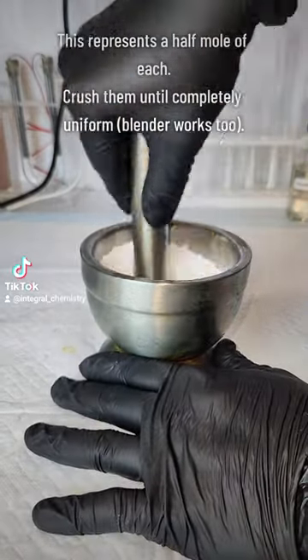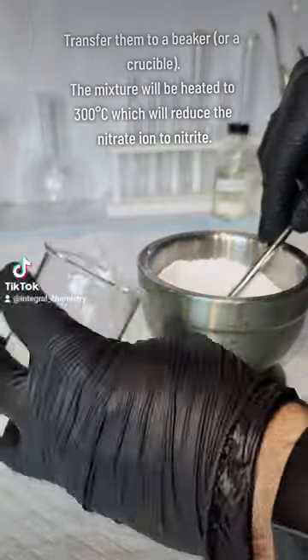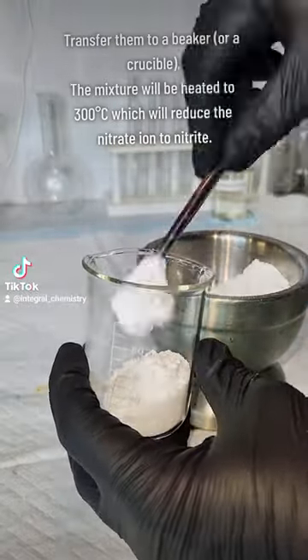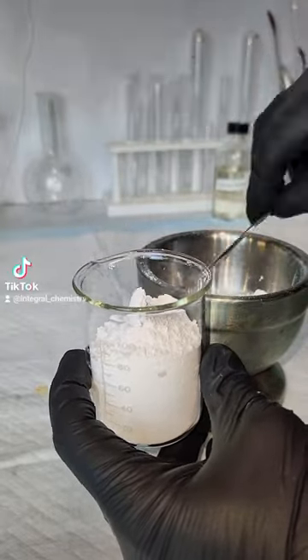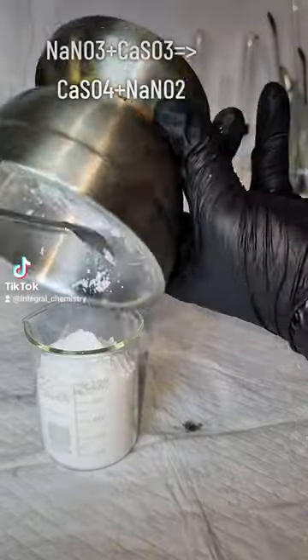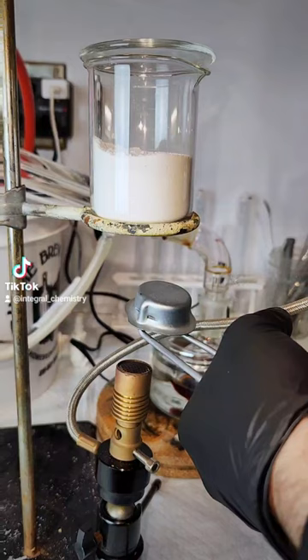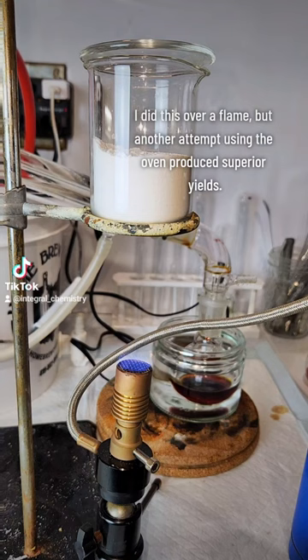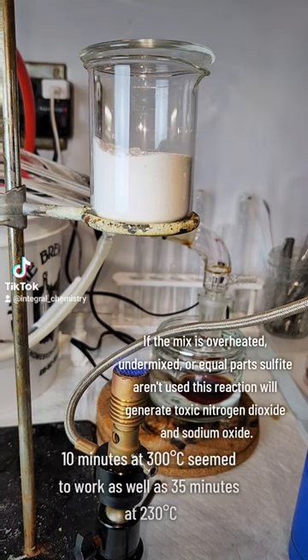To get started, I begin by crushing together stoichiometric amounts of sodium nitrate and calcium sulfite. This mixture is going to be heated, which is going to reduce the nitrate to nitrite and oxidize the sulfite to sulfate. This process is conducted entirely in the solid state, so it's really important that your reagents are as thoroughly mixed as possible. I would honestly recommend a coffee grinder over a mortar and pestle.